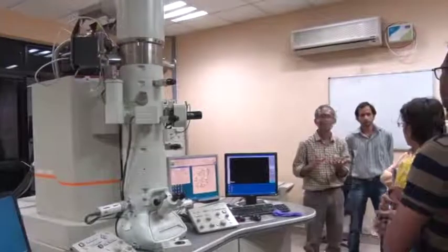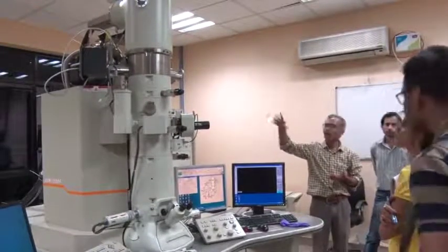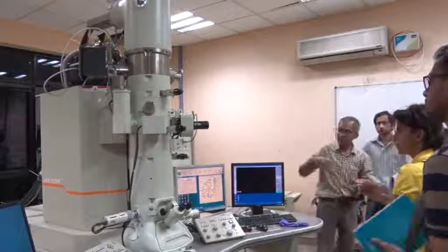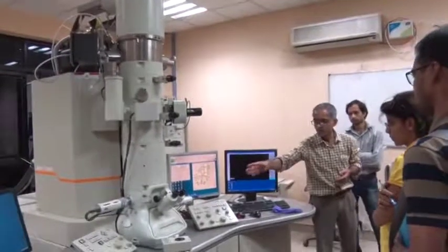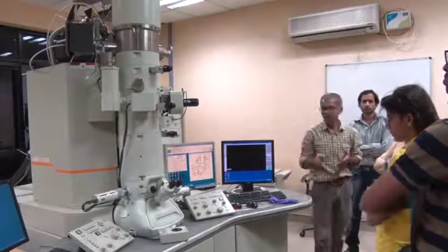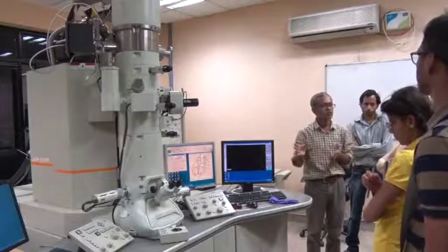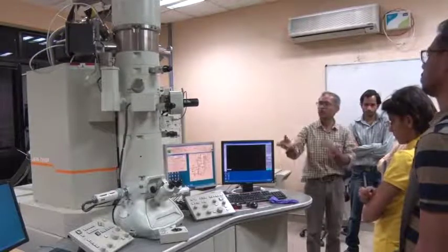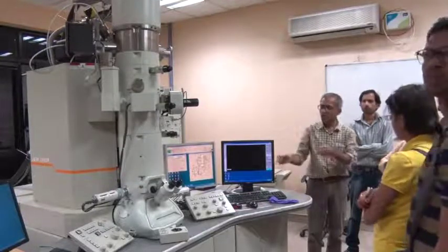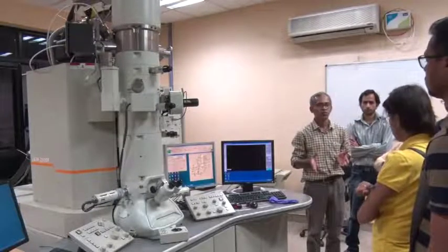So we'll do the following things. We'll first learn about the instrument, its various components. Then briefly we will revise at least the important knobs which control the lenses, and after that we will try to understand the microstructure of aluminium. But before that, after having learned this, we will also go through quickly the basic alignment of the microscope.